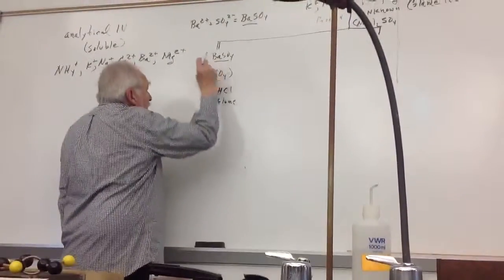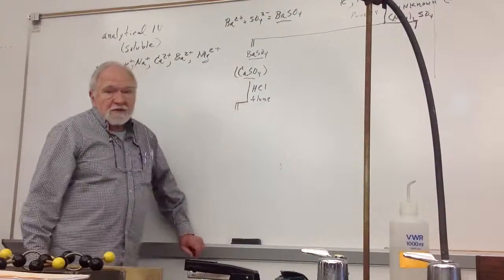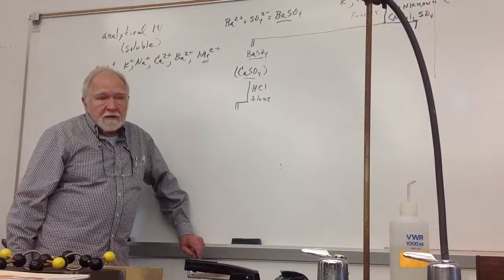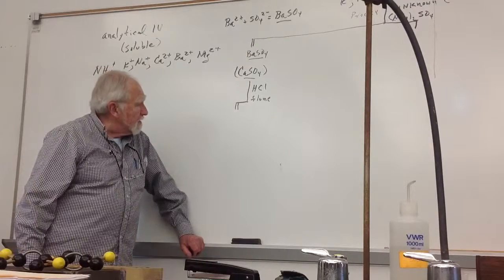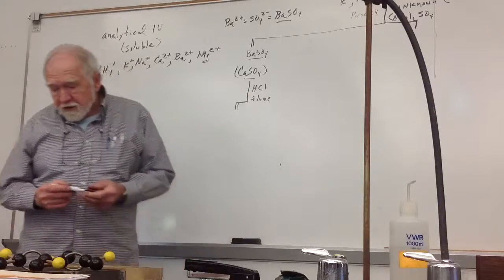But this barium has a green flame. I'll demonstrate in a minute. Calcium has an orange flame. That's one of the reasons we're doing the flame test there. Okay. That's all there is to it.